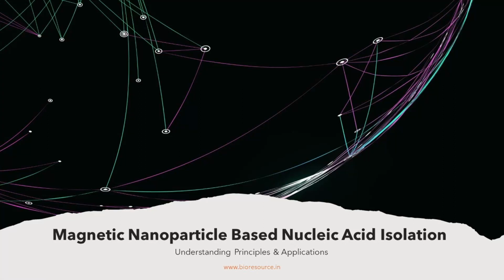In this video, we will discuss magnetic nanoparticle-based nucleic acid isolation techniques, understanding principle and applications.